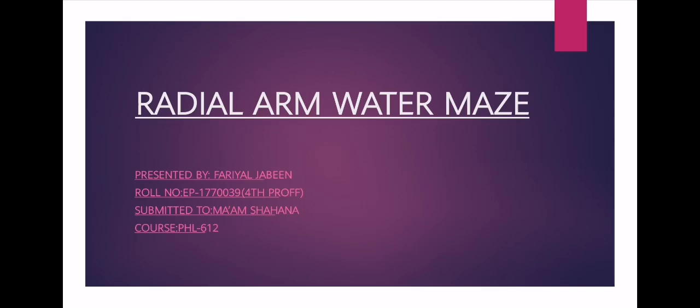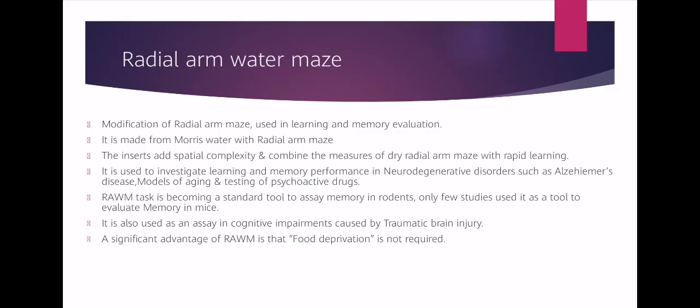EP1770039, 4th Prof Evening. My topic is Radial Arm Maze and my subtopic is Radial Arm Water Maze. First of all, we discuss what is Radial Arm Water Maze. It is the modification of Radial Arm Maze used in learning and memory evaluation and also in certain neurodegenerative disorders.